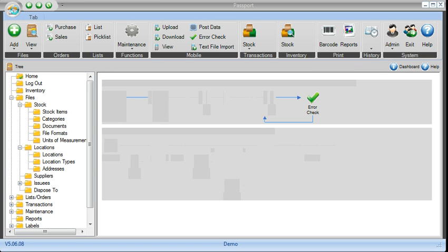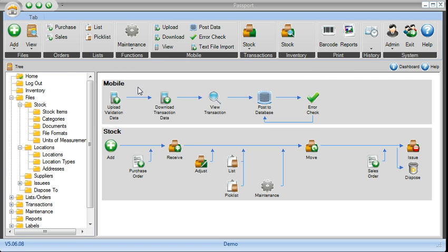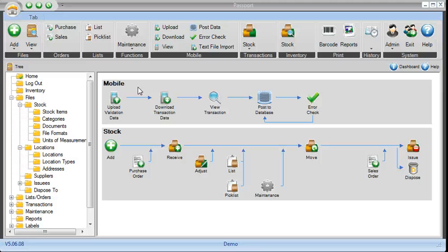At that point, with the scanner you can receive, move, issue, consume, and run reports to get all the data that you need.